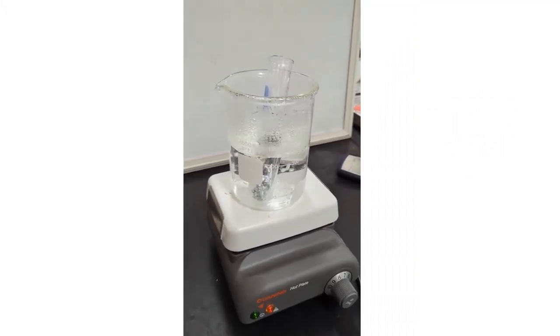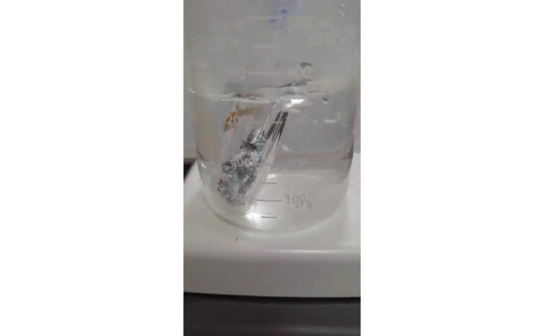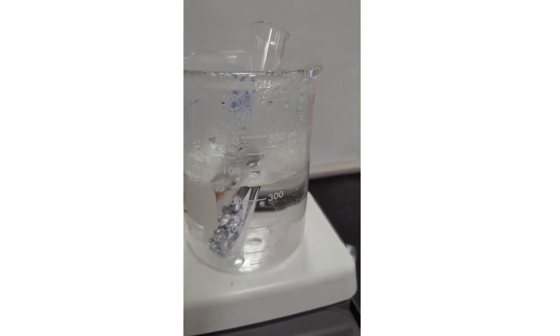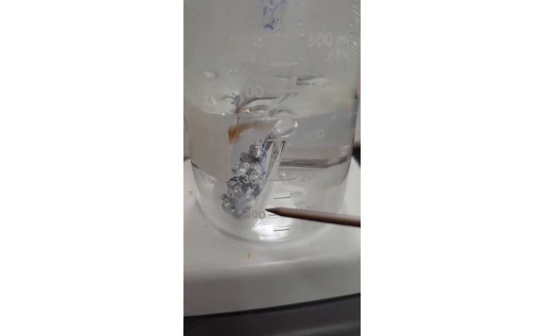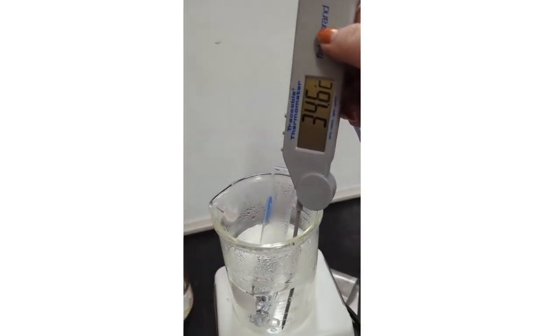All right, everybody. So I've been letting this unknown metal sample sit in this hot water bath for some time now. What I'm gonna do is take the temperature of the water bath, and because this metal has been sitting here for a significant amount of time, we can assume that the temperature of the water is the same as the temperature of the metal, because the metal has been gaining heat from the surrounding water as it's been heating up. So I'm gonna put our thermometer in here.